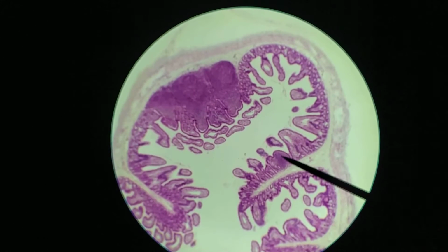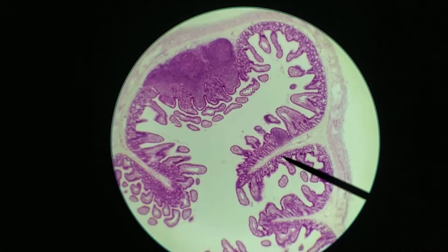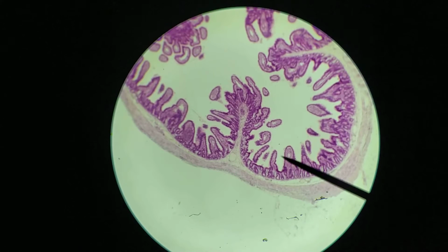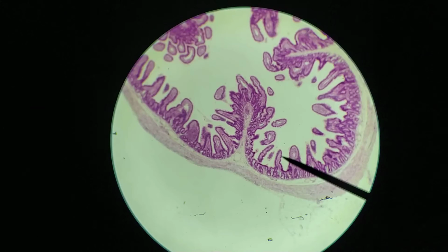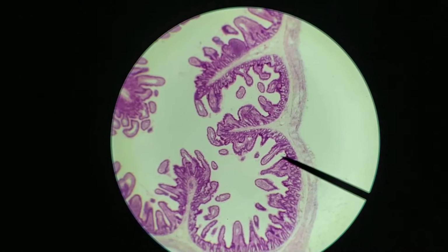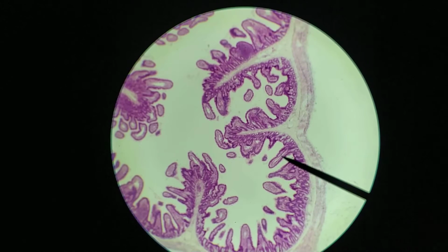Okay, and so here we're looking at the ileum. And so again, we have our villi here. It's a villus. Now the villi in the ileum are pretty simple. They're not very elaborate. They're very much finger-like. Again, the same organization as before. So there's a lacteal in the middle of this one, for example.